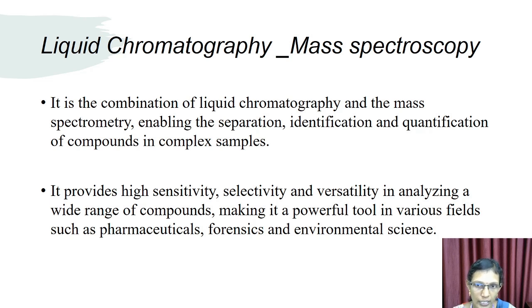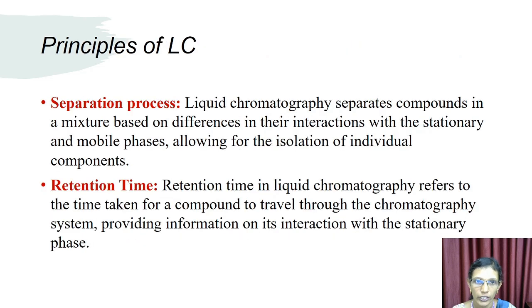So here there is separation, identification and quantification of the components in complex mixtures. It provides high sensitivity, selectivity and versatility in analyzing a wide range of compounds, making it a powerful tool in various fields such as pharmaceuticals, forensics and environmental sciences too. So here also the same thing, the separation process.